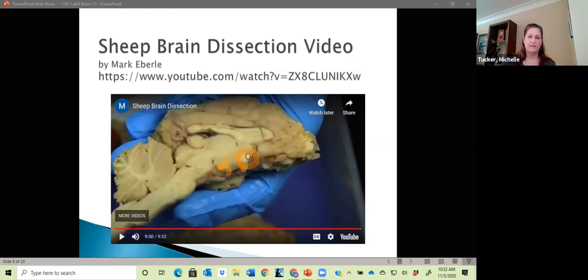So the hypothalamus is this area that's located in between the optic chiasma and the mammillary body, and is inferior to the thalamus. The thalamus is very round, and then you have this odd square rectangular area below it, and this is the hypothalamus.